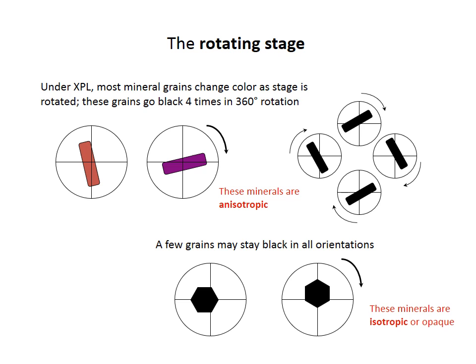So here's a slide illustrating a bright grain with an interference wave pattern producing false colors. And the light from that grain, rather, is blocked as the stage is rotated. So we now have seen three different ways that a mineral grain can appear black under cross-polarized light.